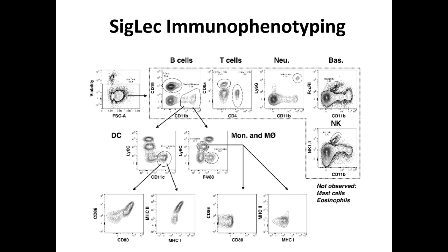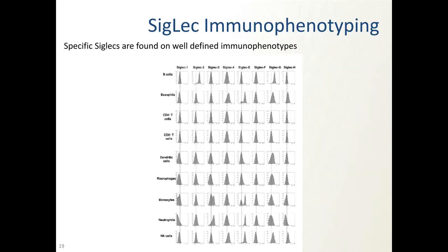So here's a case of him looking at all these different cell subsets, and then all these different cell subsets will have different levels of expression of these different carbohydrates, and so you could cross-reference all this. And in this perfect world, we would be able to sort it all. Okay, so now Bigfoot's finally working. Let's get him to prep this.